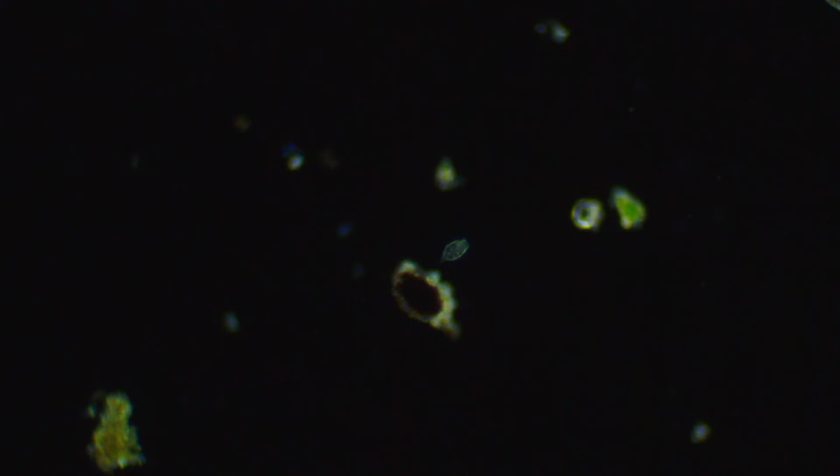Oh, try not to bump that table there. That was me shaking the table around. Because he's like, no, don't shake it around, I need to be stable so I can come out here and catch stuff. I think this little guy's fascinating. I wish he was bigger so I could see him better, but I think he's great. Little rotifer. He spins it around so fast, sitting there just catching food, stuck to a piece of moss.